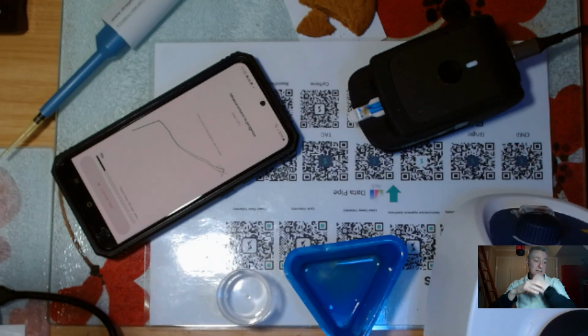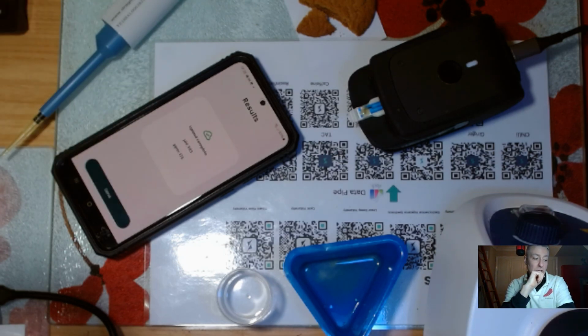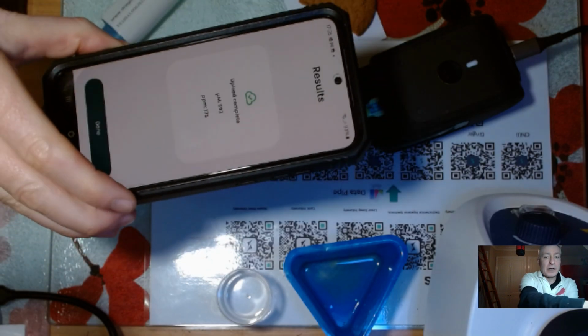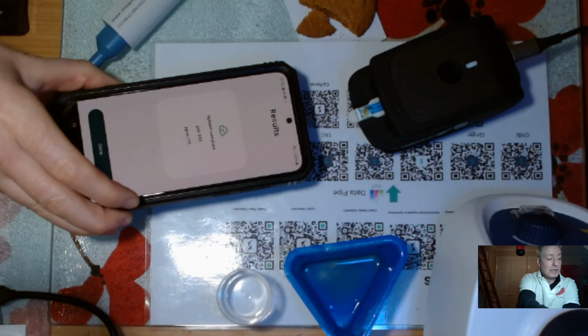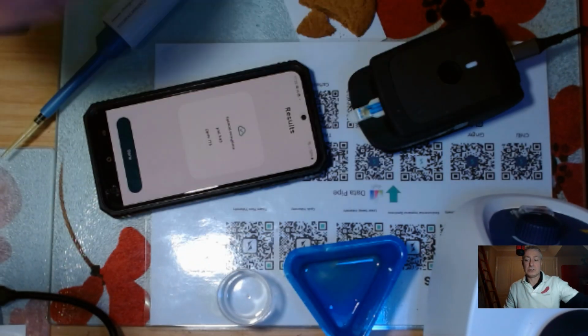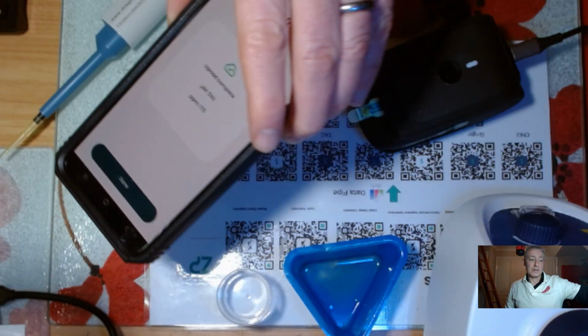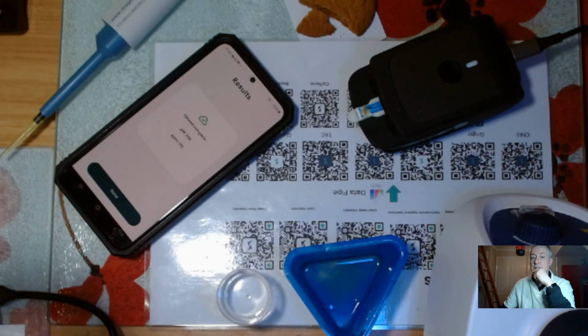Now the actual analysis only takes 13 seconds. I can see a small peak there, and then it'll do it again, and I'll see another small peak. These are the small peaks for gingerol, but you don't have to interpret that data. It is very mild. In fact, it's wonderful because I've been doing some testing this afternoon. I tested ginger root and got approximately 2000 ppm. I tested a ginger powder and got about 27,000 ppm. But this ginger biscuit is 175 ppm, which was the order of magnitude I was expecting.